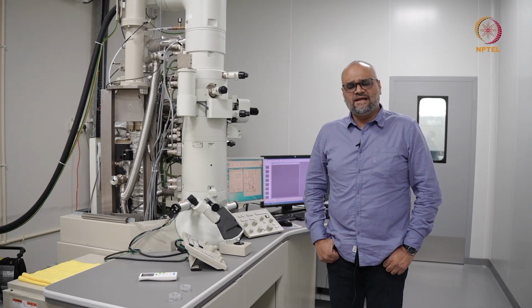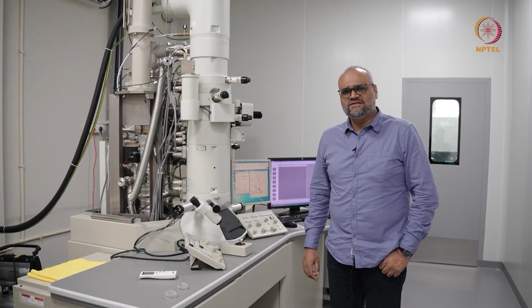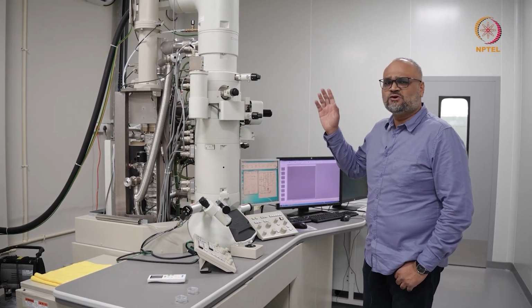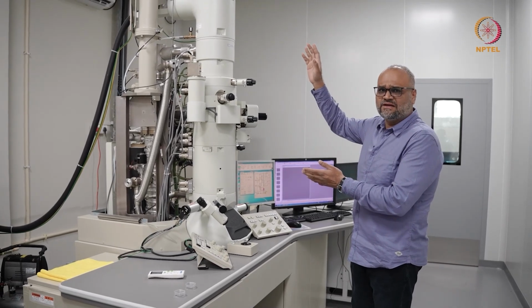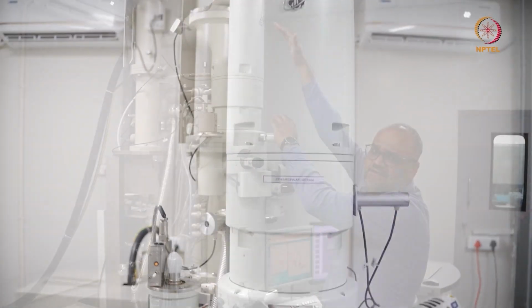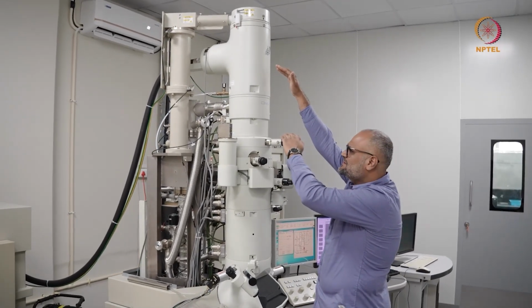We've seen the ray diagram of a transmission electron microscope, and we've drawn comparisons with an optical microscope. Right now, we are next to the JEM 2100, which is a lanthanum hexaboride filament operated TEM. This microscope runs at 200 kilo electron volts, and here are the various components of the microscope. As it was discussed a little earlier, this portion is where you have the electron gun. In this instrument, we actually have a thermal emitter. It's called a thermionic emitter.